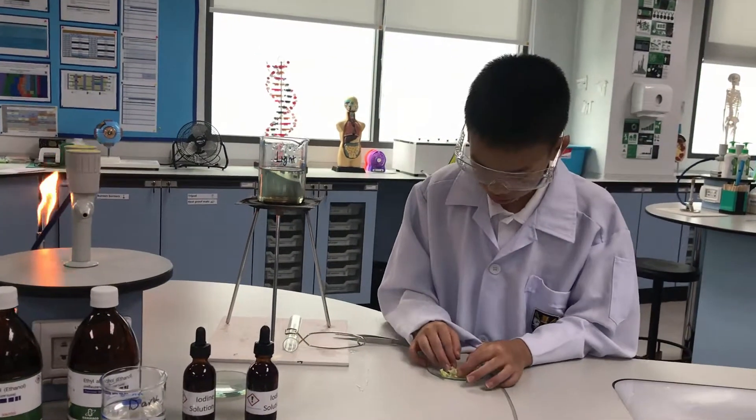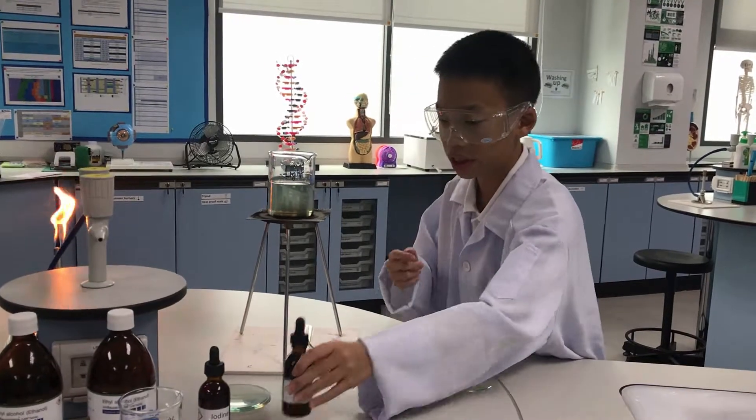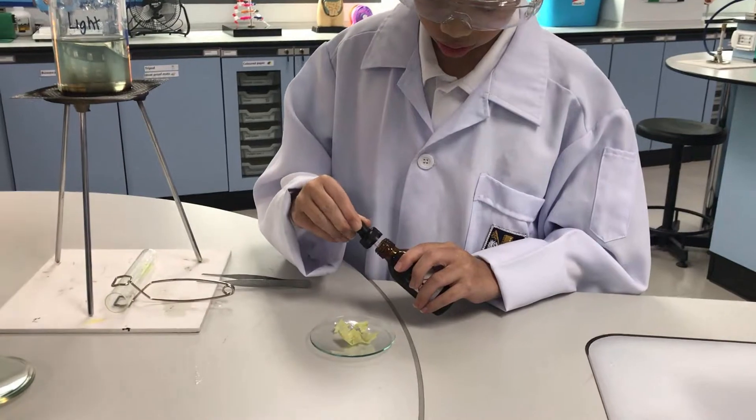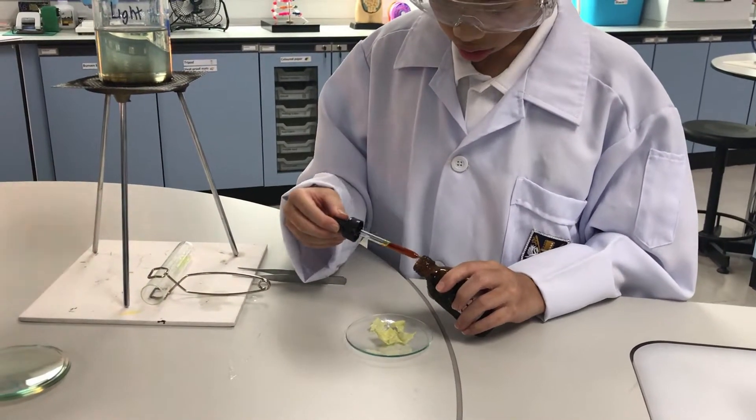Now we have removed the leaf from the tube and put it on the watch glass. Now we'll put iodine onto the leaf to test for starch.